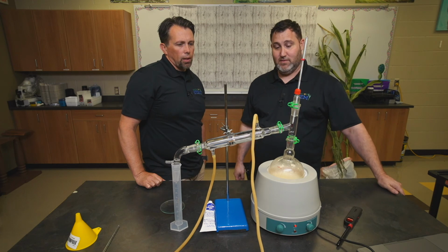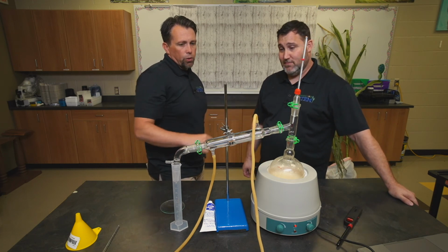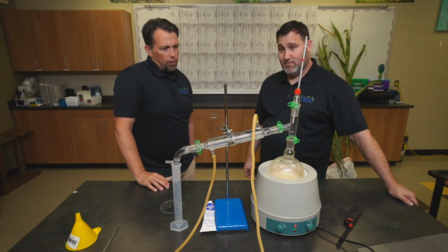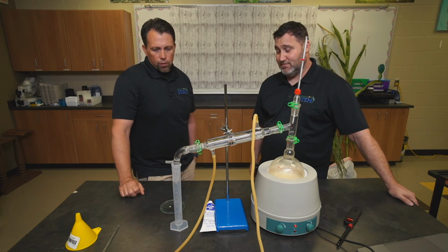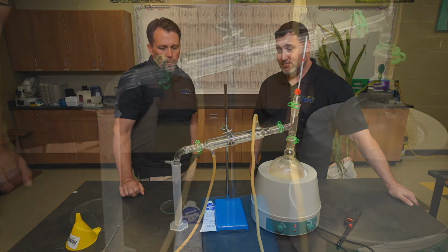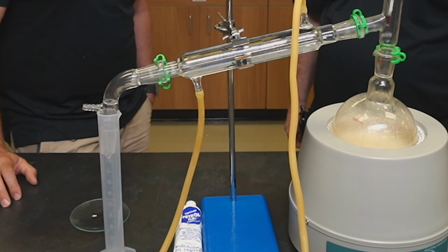Okay, we're starting to get a lot of vapor condensing in the condenser, which is what we want. So we're going to turn the mantle down a little bit so we don't heat too much water. And we're starting to get some distillate dripping into our graduated cylinder. Again, based on our calculations, we don't want to go much over 20 milliliters.